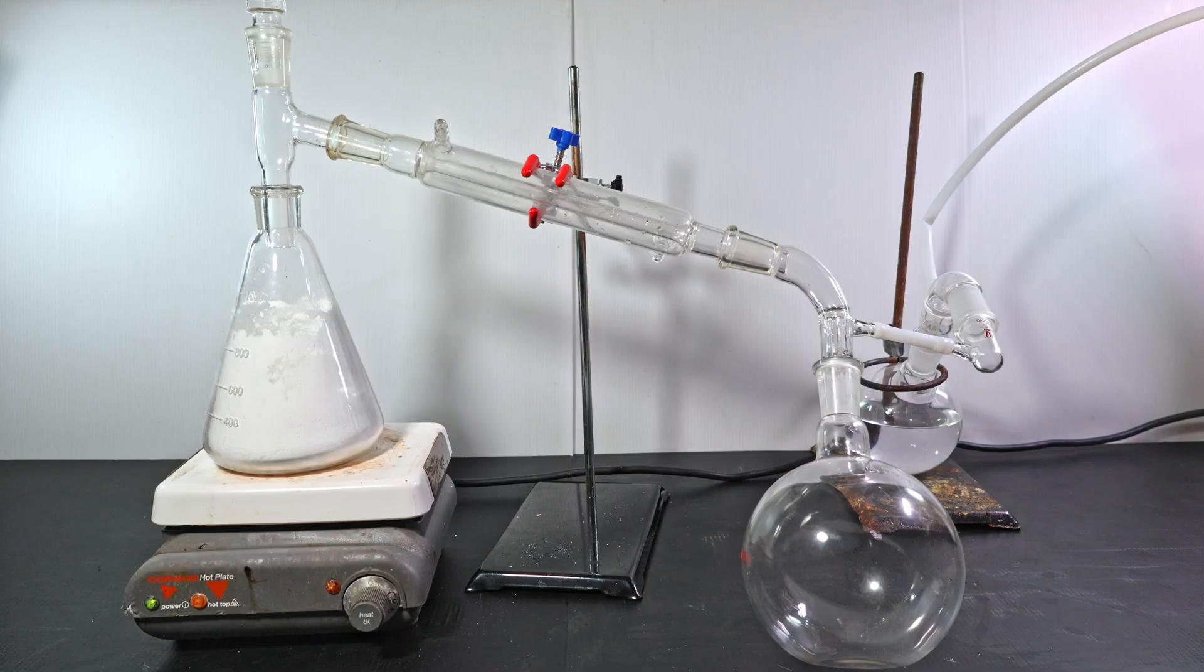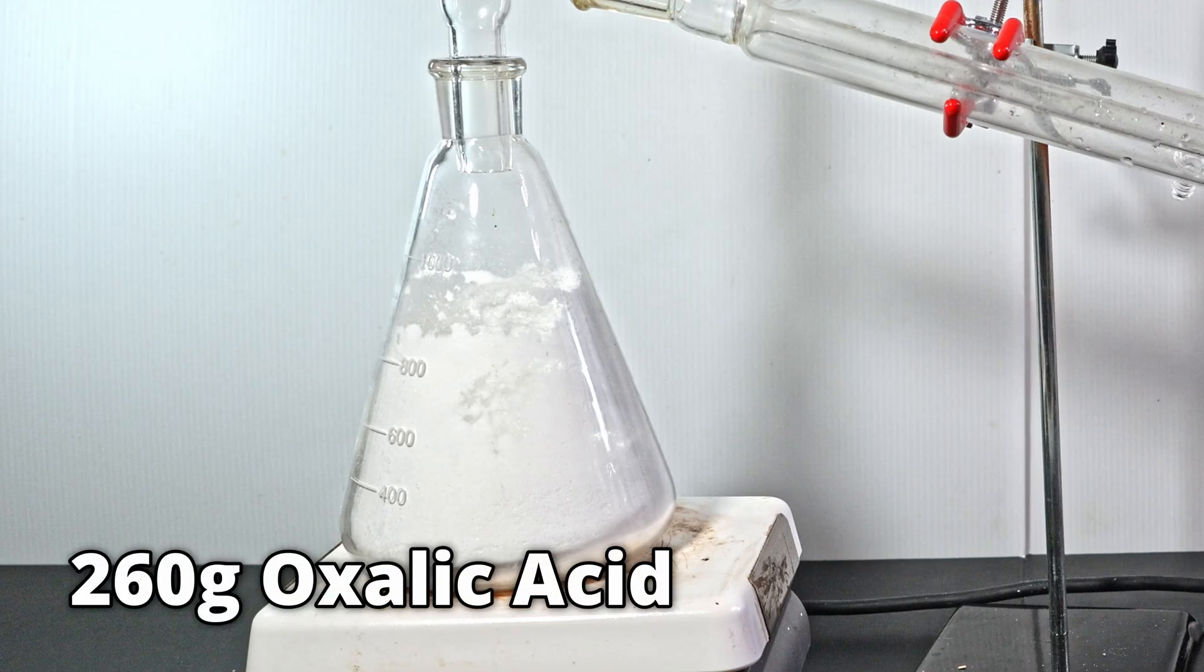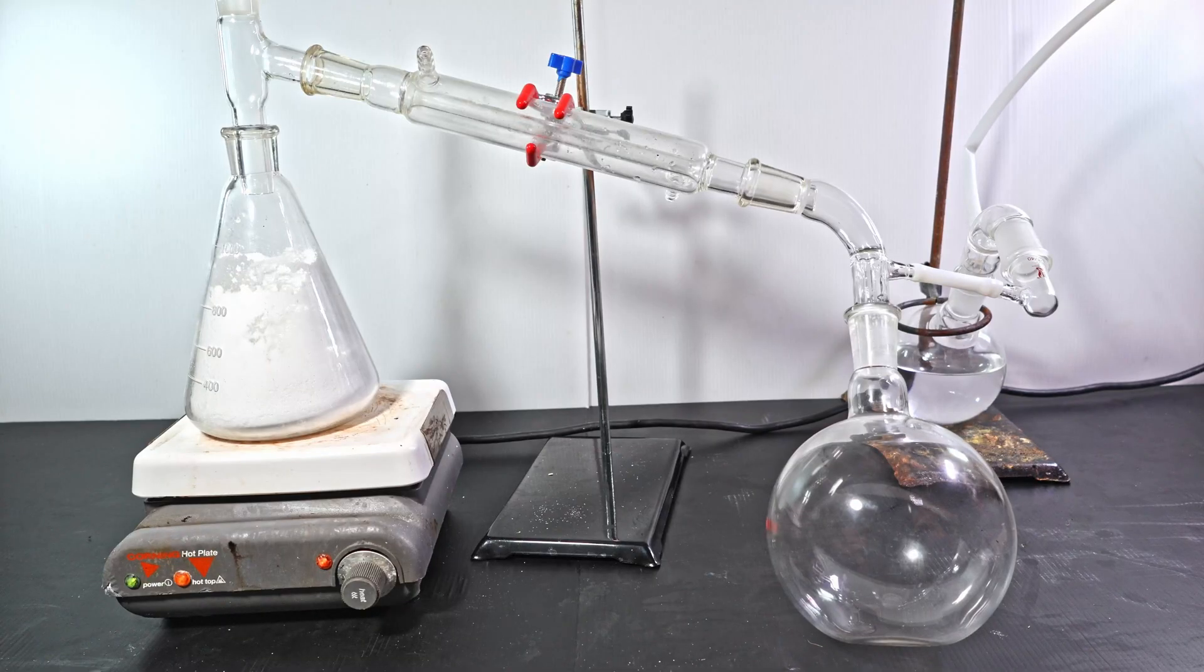For my next trick, I try to dehydrate the oxalic acid by vacuum. Contrary to what you see, I promise you it is not filled up, not even a tenth of the way. I've actually spread around 260 grams of oxalic acid around the walls of the flask. I heat it up to 130°C and turn on the vacuum.